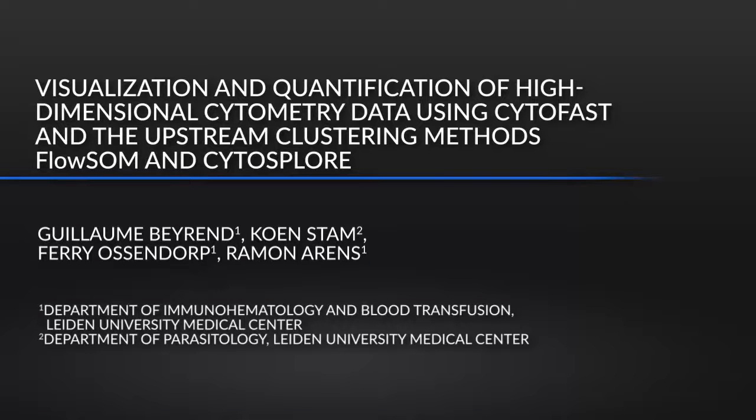The data generated by mass cytometry are complex and need to be visualized in an efficient and simple manner. Cytofast is a method which highlights immunological patterns within the immune cell population and determines cell subsets which are linked to clinical treatment or experimental group.